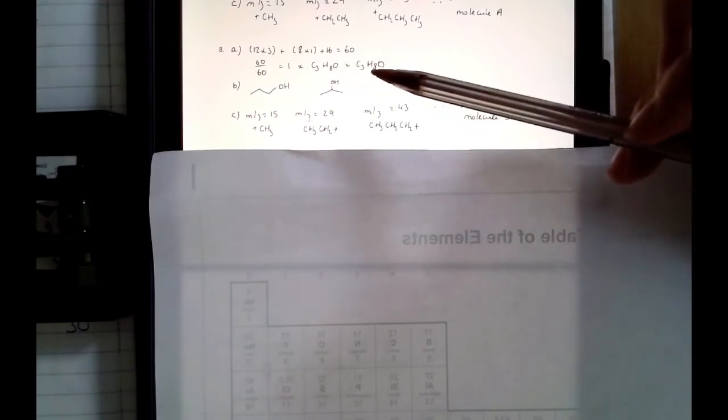Question 8 is a similar story. I find the relative formula mass. It matches the formula mass of the molecule. Therefore, the empirical formula and the molecular formula are the same, but I need to show that. I draw out my 2 possibilities. I've got propan-1-ol, I've got propan-2-ol, and then I analyze the peaks. First peak is at 15, typically from a CH3. Both molecules can give me a CH3. Both molecules are likely to produce that peak.